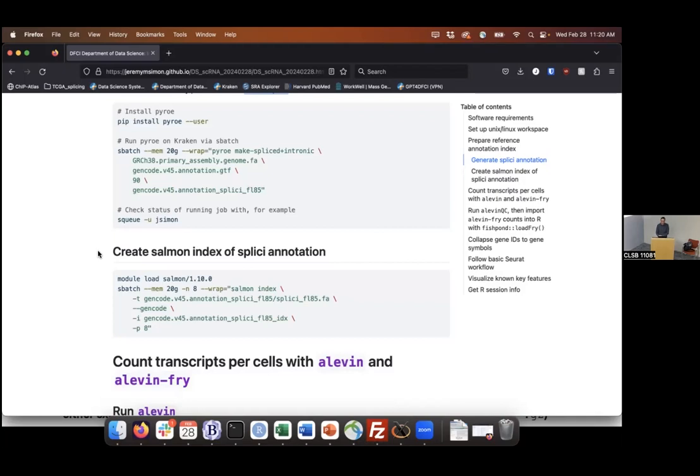So it's just counting how many 31-mers occurred how many times, all possible 31-mers that span the entire splicey reference, so that once we actually go to the counting stage, we can quickly query that 31-mer index, ask how many times the sequence occurred, and therefore what gene it was derived from. Very basic explanation of what this is doing. It's far more complicated than that. Hopefully that's not an oversimplification.